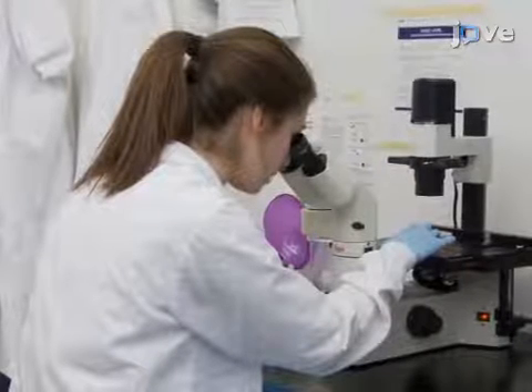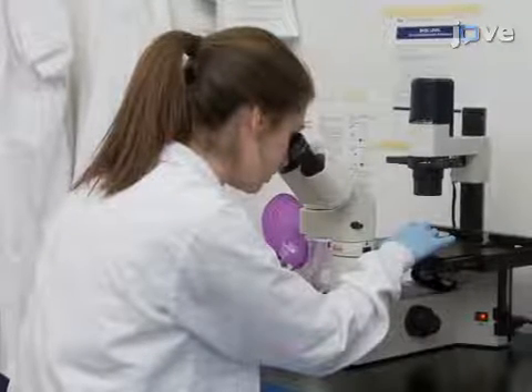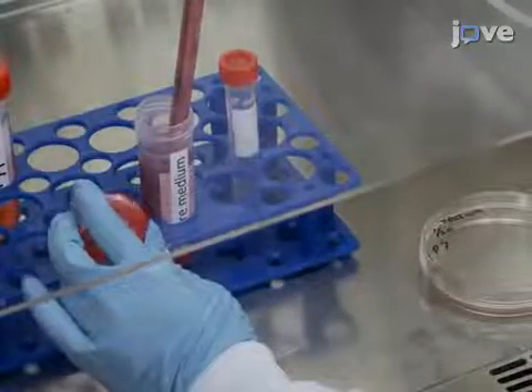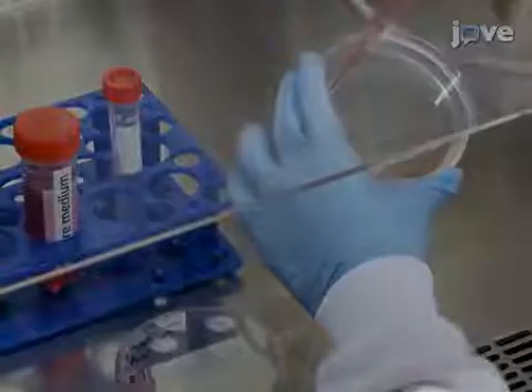When the cells have lifted from the plate, neutralize the reaction with 7 milliliters of serum-supplemented culture medium.